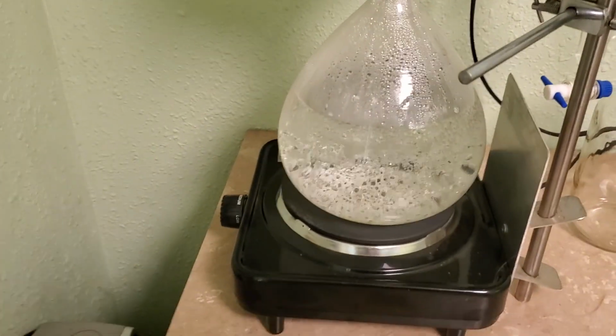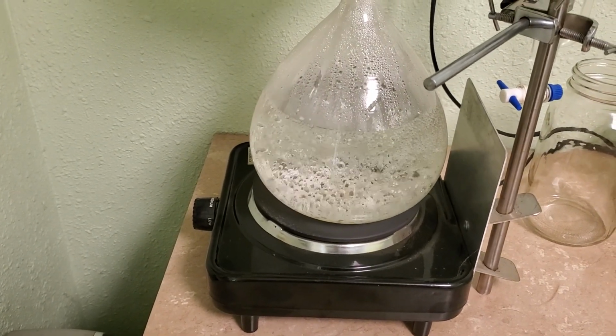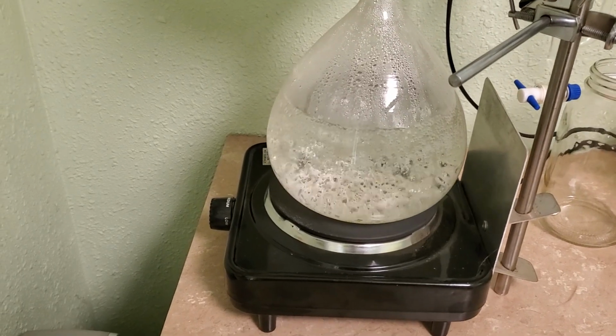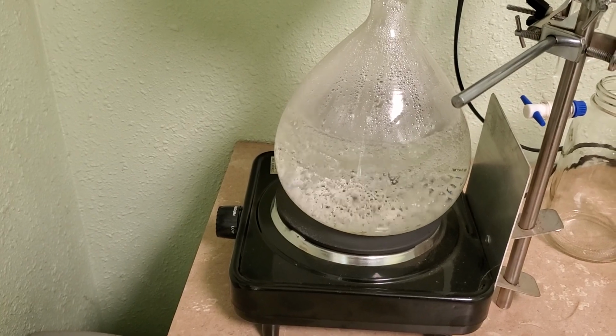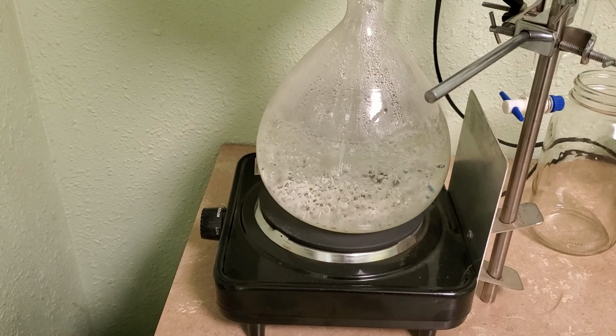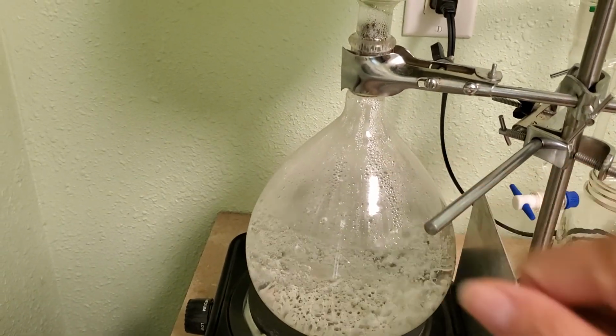So here you can see the main flask, which has distilled water in it. It's really important to use distilled water first. Anything that might come in your tap water, chlorine, fluoride, anything else, will end up in your final products that you've distilled. So starting with distilled water is really best. Things are really boiling here, and so you can actually see steam that's starting to be produced.